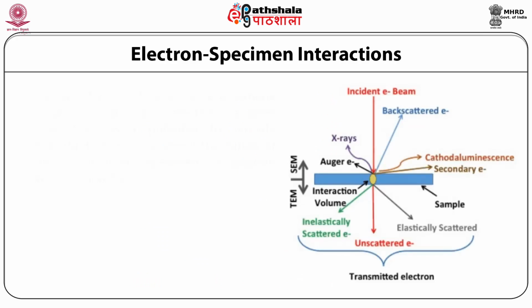Electron microscopy is a technique that offers unique possibilities to capture images at nanometer resolution for understanding the structure, topology, morphology and composition of a material. Primary electrons, after collision with atoms in the specimen, impart energy to the specimen, resulting in a loss of energy or change in momentum of the primary beam electrons, which gives rise to the production of an equivalent amount of energy in other forms.